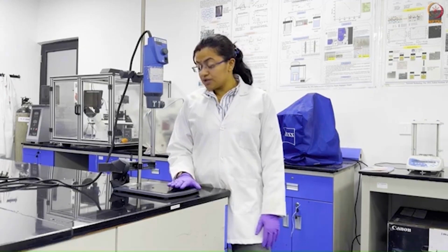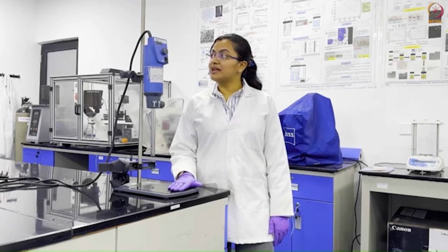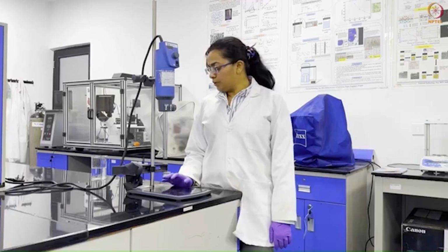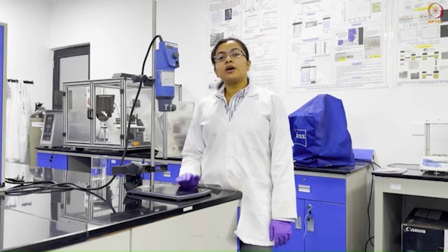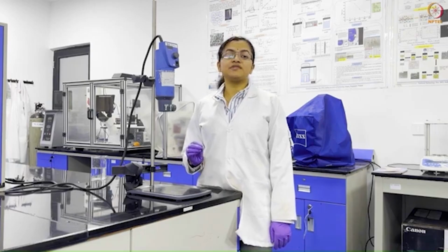This homogenizer has various applications in the field of sonochemistry. It can also homogenize water samples, liquid samples, biological samples. It can help in particle size reduction and emulsification of the sample, degassing, and then cell destruction. Now we will see how the speed of this homogenizer varies in a water sample. So we need to note what kind of RPM requirement there is for different kinds of samples.